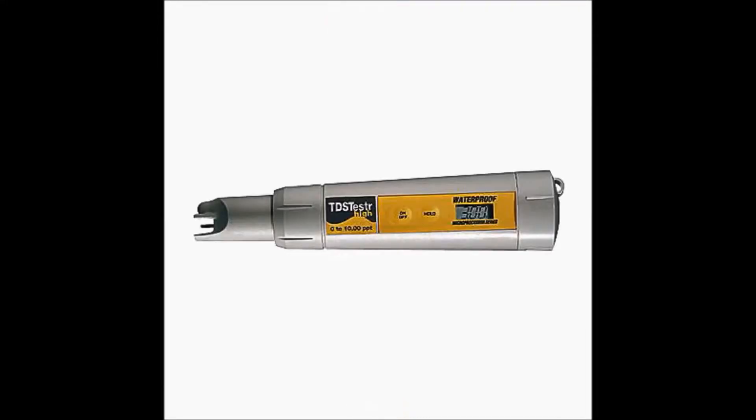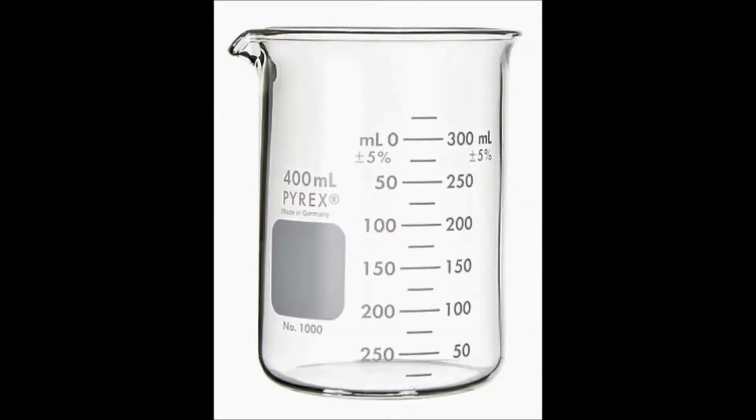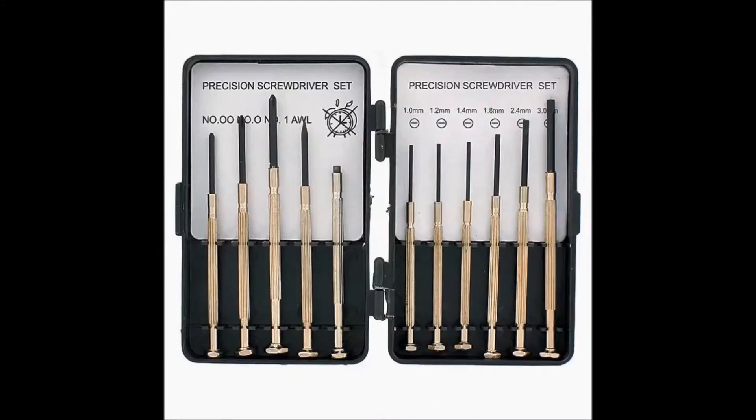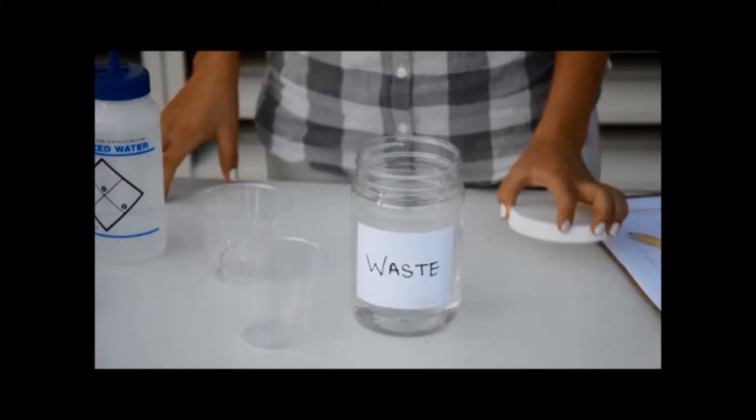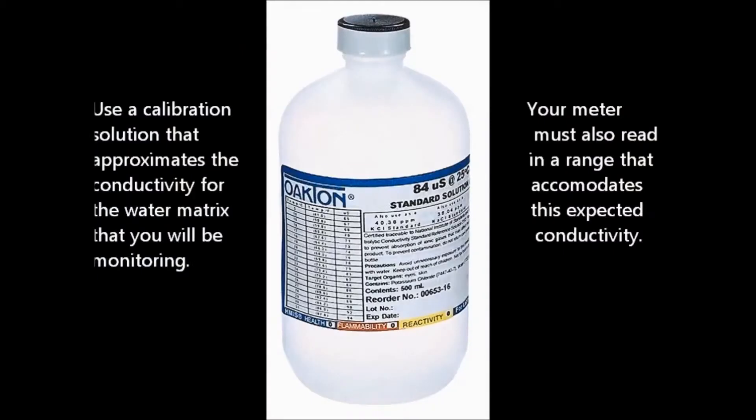In addition to your meter, you'll need some other supplies: perhaps a set of screwdrivers, a squeezable squirt bottle filled with DI water, a closable waste container, and your calibration solution.